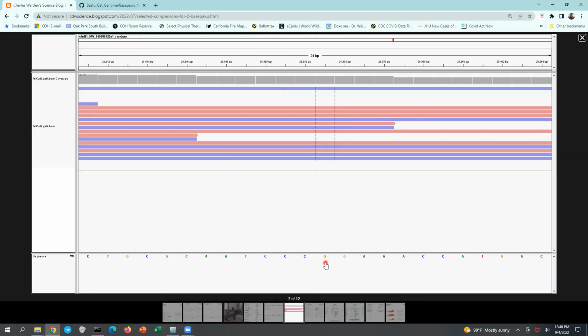The thing that's important to understand is that this is DNA sequence, and DNA is double-stranded, so you could actually represent the sequence with either of the strands, and it just so happens that the genome build uses this strand, and the reverse complement of a G is a C. So if you use the other strand, it is a C. Now, it's hard to see, and I apologize about that, but there's an A in this read here. However, there are no A's at this particular position we want to look at, and the reverse complement of an A is a T.